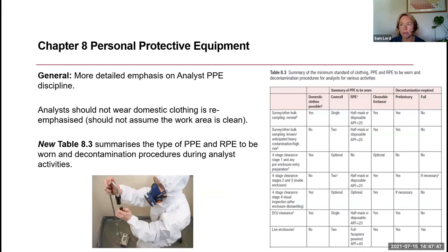All nearly done. So personal protective equipment. This is again for analysts. It's really trying to make sure that they're more disciplined in what PPE they wear. They shouldn't wear domestic clothing when they go into the enclosures doing four stage clearance. I know when I was an analyst many years ago, we did, but that was the practice back then, but it very much shouldn't be now.